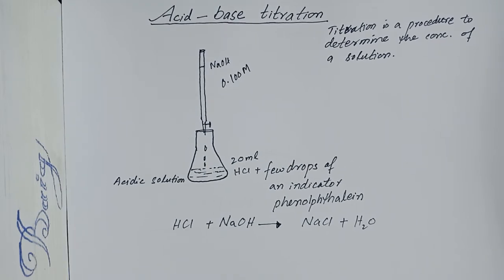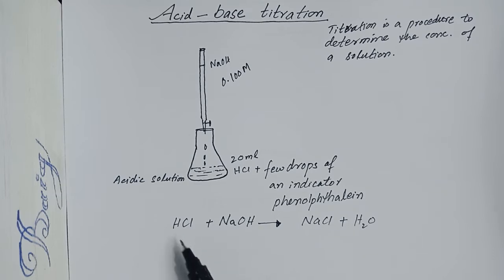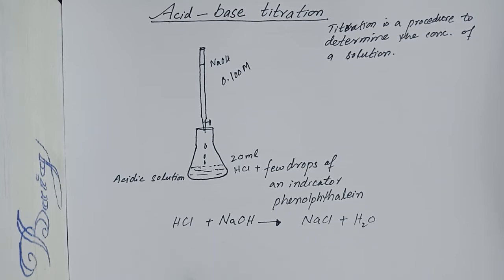In this reaction we are using the process of acid-base neutralization, because the acid and alkali solutions are being neutralized to produce a salt with a pH of around 7.